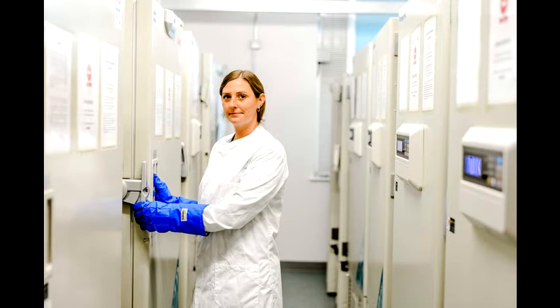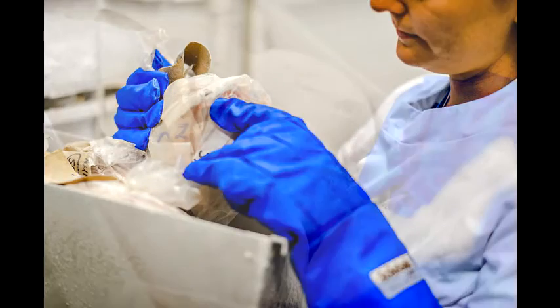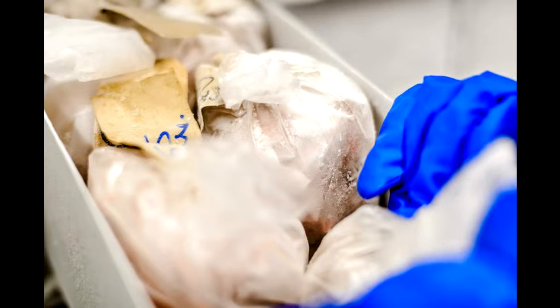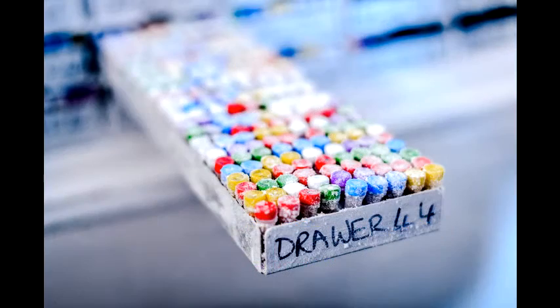This is the freezer room where we keep all of our frozen samples. It's particularly useful for research because it's the type of tissue we can use to look at different protein levels in the brain, conduct different scientific assays, and look at the activity of proteins as well. When we dissect a fresh brain we dissect it into the areas most of use in research and most requested by researchers — that's what these different colour tubes are. They represent different areas of the brain most involved in dementia. We store them in this format so that when requested by researchers, we don't have to go back to the original tissue to defrost it.